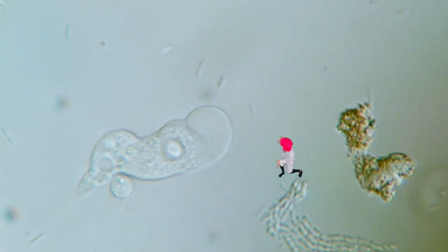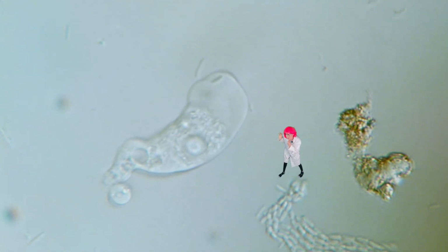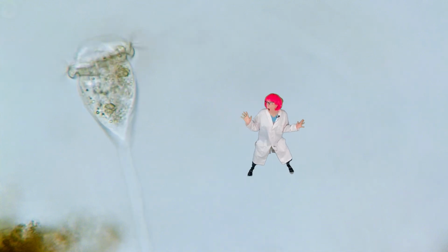Ooh, what's this? You're right. That's the amoeba. Ooh, now didn't that one look a little different than the other ones that you've seen? Remember, I told you the one group came in all kinds of shapes and sizes. The one with the, right, the rotifer. That's a rotifer. Good job.